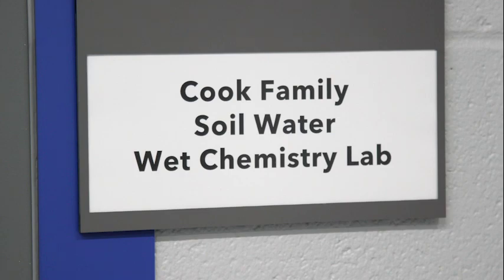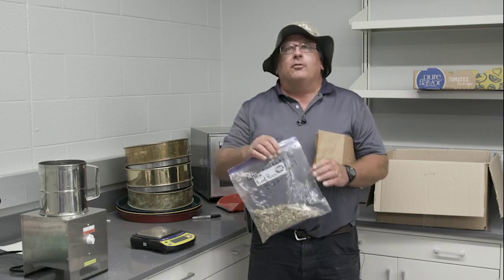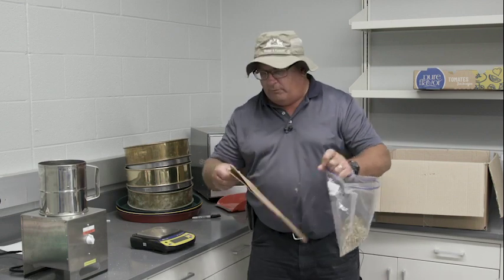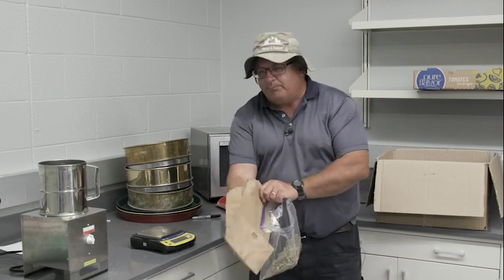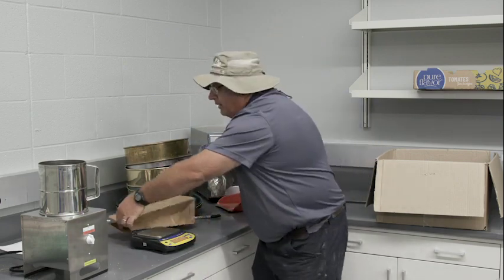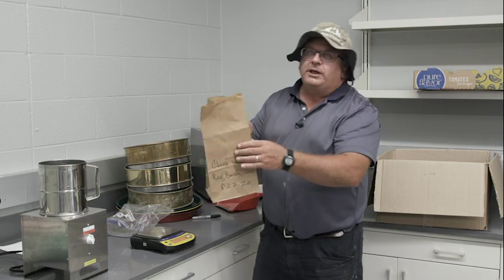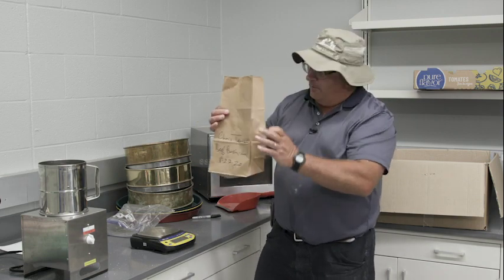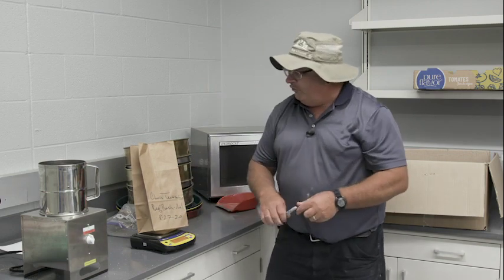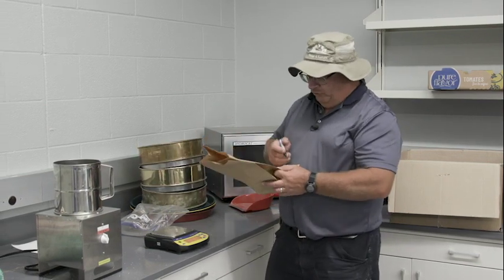Once we get the sample taken in the field, it will come into the lab and we will dry the sample overnight. The procedure is to take the sample from our bag from the field and transfer it into a paper sack. We want to make sure we get the whole sample in there and don't miss any of the fine material on the bottom of the bag. Once we get the sample in, we'll weigh it on a scale and record what we call the fresh weight on the bag. This sample weighs 49.9 grams.